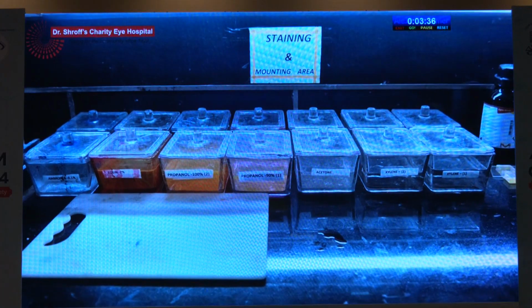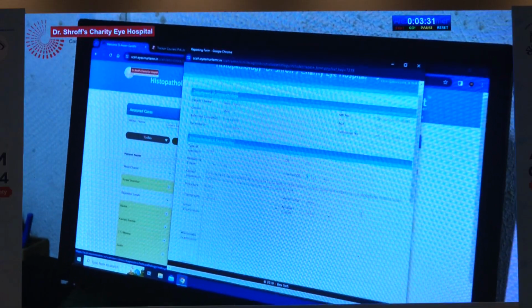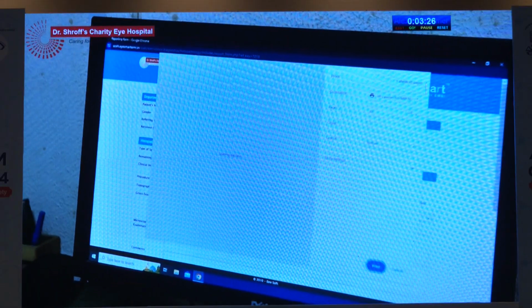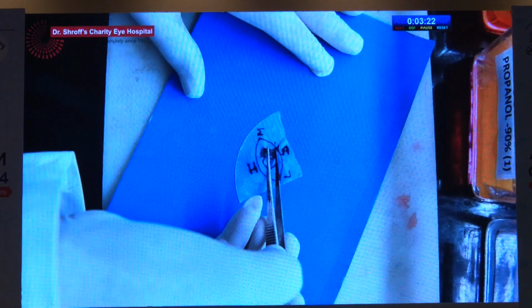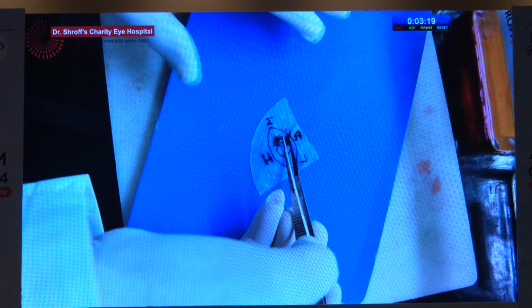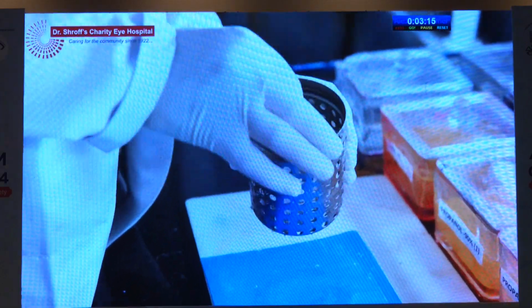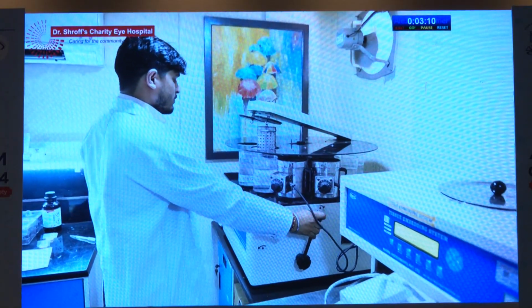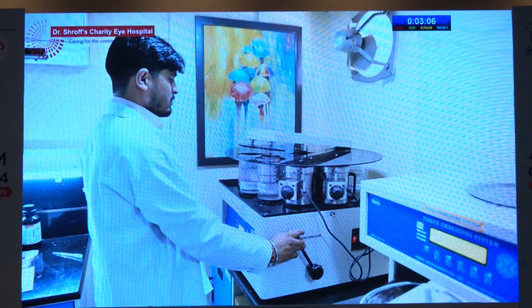Histopathology is a very important part of ophthalmology. It involves the process when the surgeon takes out the biopsy and sends it in 10% formalin. After that, the grossing process is done. The grossing involves the visualization of the specimen, identification, and checking the labeling. Different sections are taken during the process of grossing. The biopsy is then put into a tissue processor for overnight fixation and processing. The next day, the biopsy is converted by multiple steps into paraffin embedded blocks.